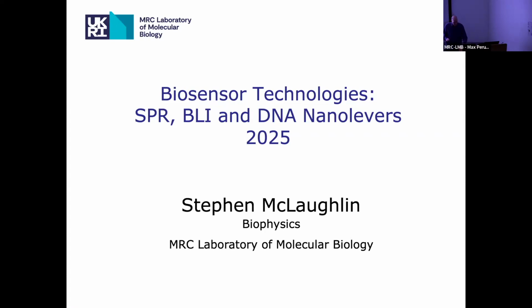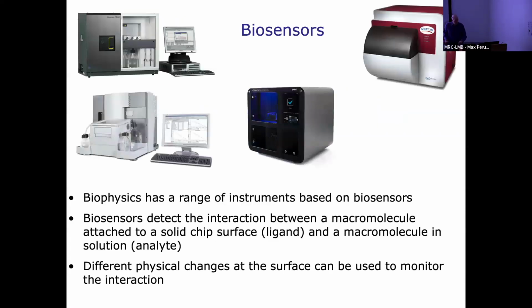So today we're going to talk about biosensors. When we talk about biosensors, we've got a whole range of biosensors based on different kinds of physical principles that are used to detect things. Basically, you've got something attached onto a surface, and that's going to be called the ligand.